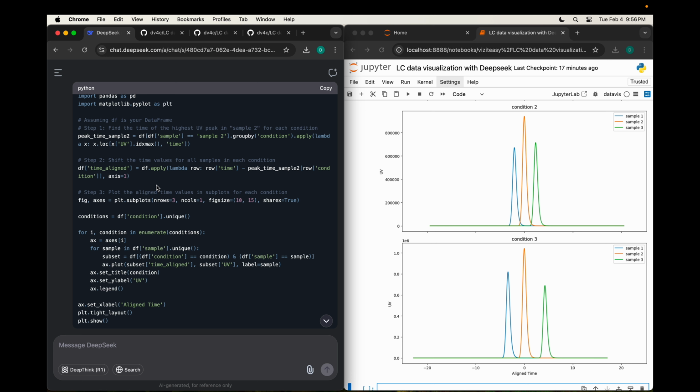This is a short comparison video, or I guess not exactly between DeepSeek and ChatGPT, but a comparison of DeepSeek against some of the historical performances we saw, or historical struggles we saw with ChatGPT in certain application cases.